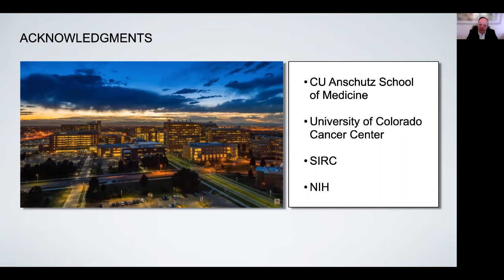So in essence, in the stain, under a day, you can have very helpful information, especially if you're looking at a complex that nobody has any idea about in terms of structure. If you're talking about CryoEM, you're talking more like a week, perhaps with a couple of days of data collection, or up to a few months, depending on the behavior and the complexity of the project.